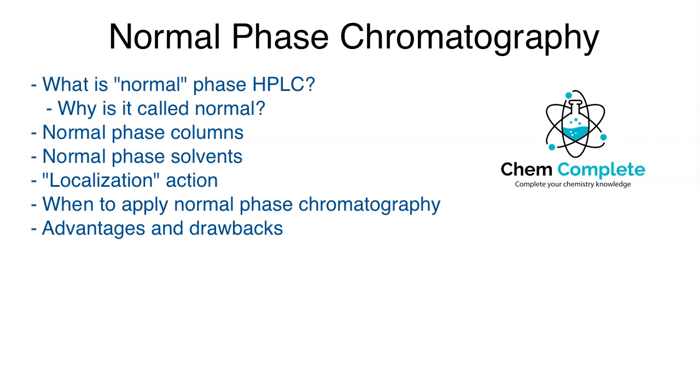I am Professor Tomney, and let me just say this lecture is a long overdue one, and it has been requested by many people over the past months. So today we are finally going to continue the HPLC series, and we're going to learn about the next HPLC phase typing, which, believe it or not, is known as normal phase.